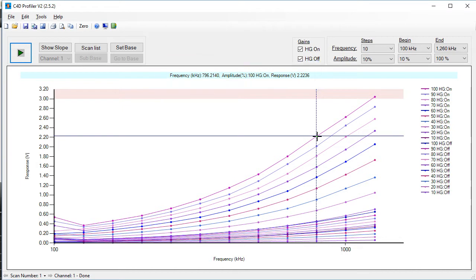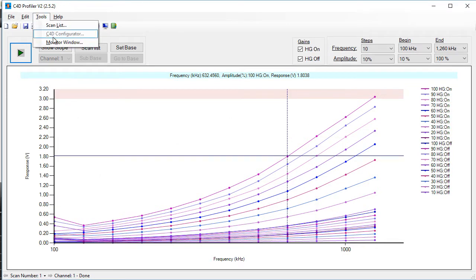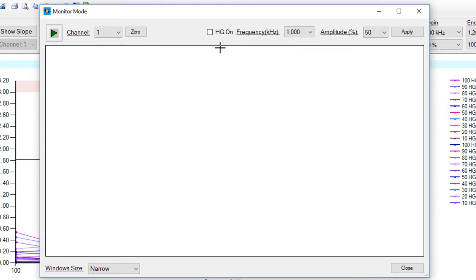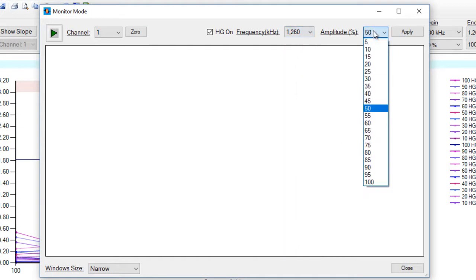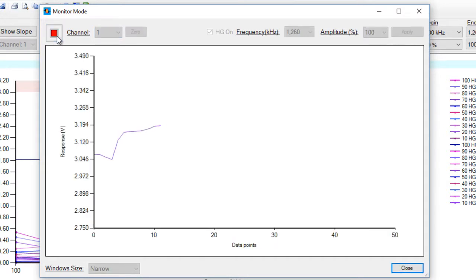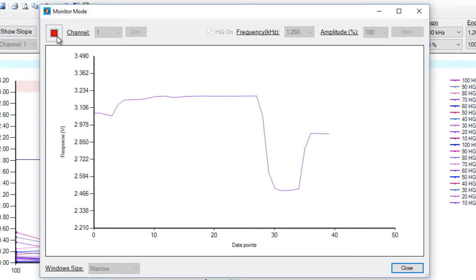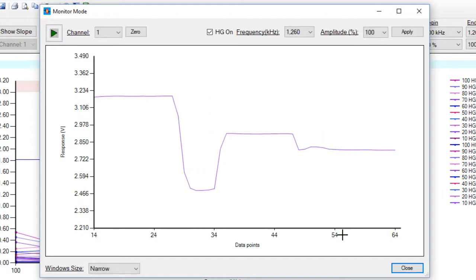You could also get a better idea of the optimum settings by diluting your background electrolyte by 10% — that's 90% background electrolyte, 10% deionized water — putting that into the capillary and seeing the difference. We're going to do this now, using the monitor window to inject the diluted background electrolyte. I'm going to choose the maximum settings again and inject my diluted background electrolyte. There it is. Click Stop and Close.